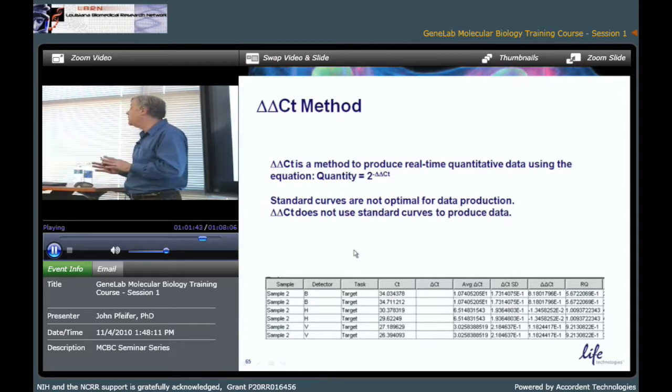So you have full flexibility in the software to choose a different calibrator, if you see fit to do that. But realize, if you change a calibrator, for relative again, it's not going to change the quantitative relationships among your samples one bit. All it's doing is changing the numbering system. So don't be afraid. You want to change the calibrator? Great. Obviously, absolute calibrator, that's a different story.